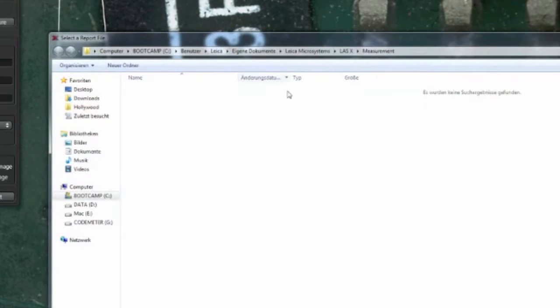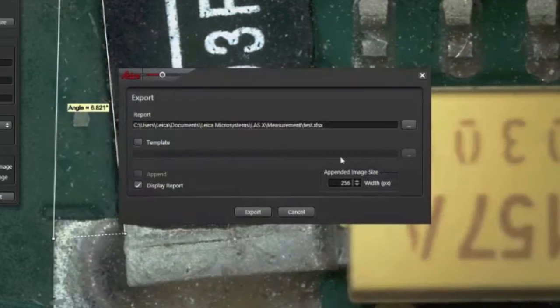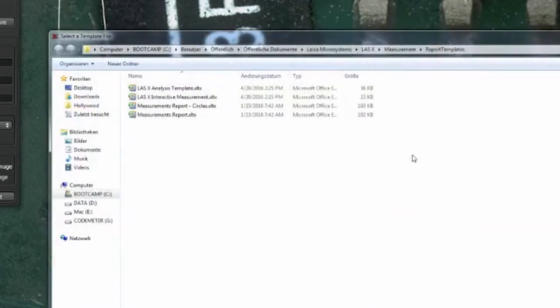I can choose where to save the report, and I can use a template. There are different templates available, and these templates can be edited to fit your customer needs.